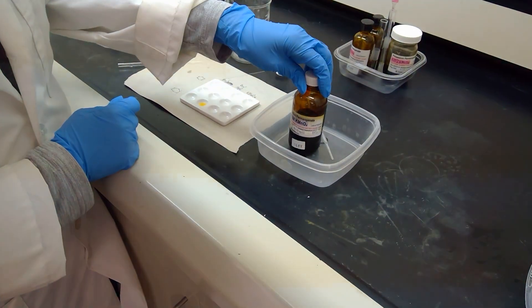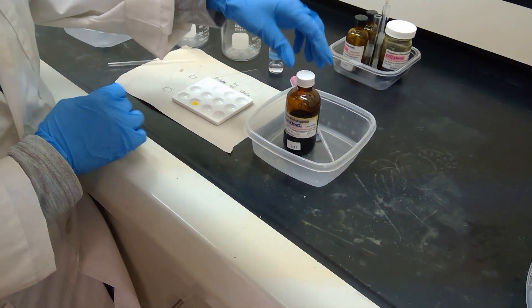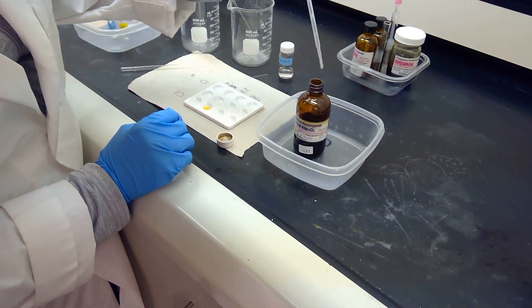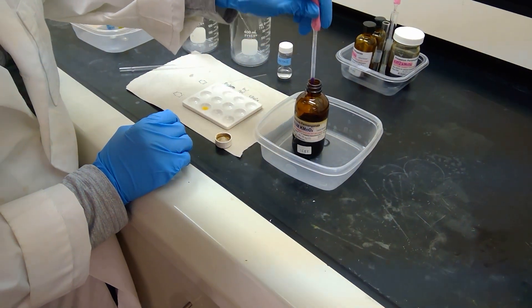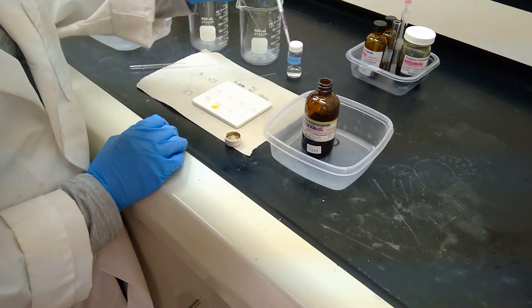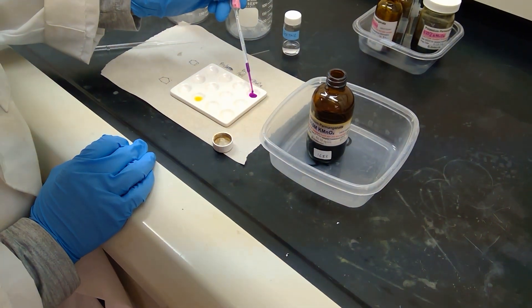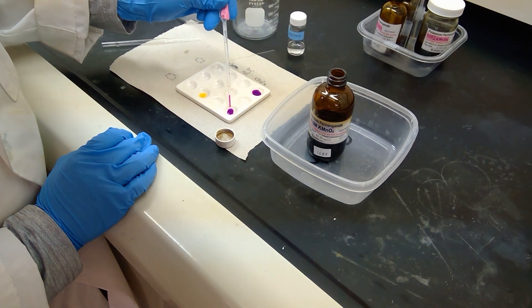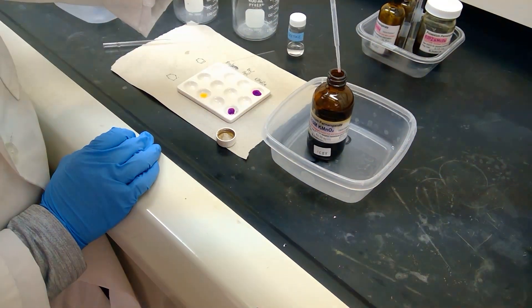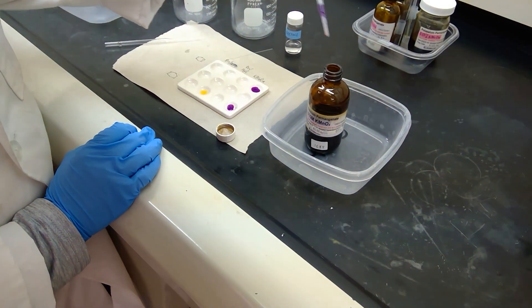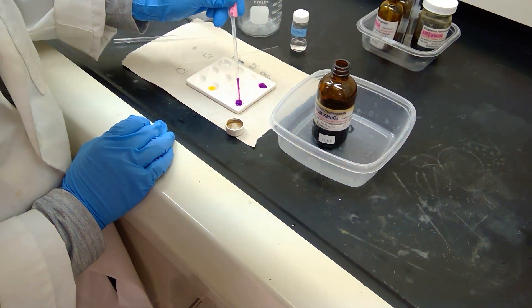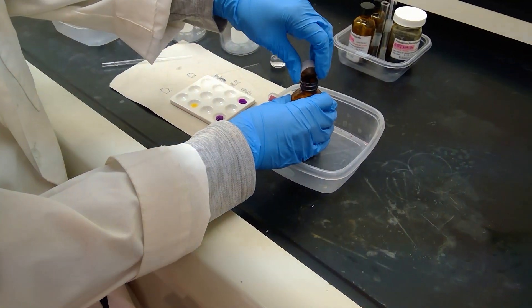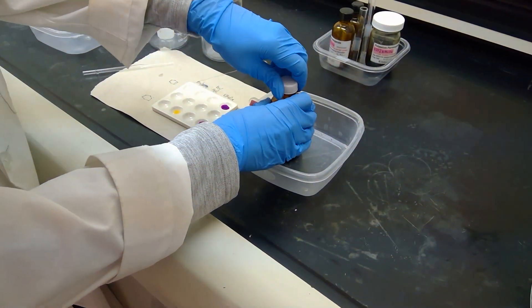For our next chemical test, we will be using some potassium permanganate. We're going to test both of the hydrocarbons from before. I'm going to take a couple of drops of potassium permanganate. Once I get it onto the spot plate, I want you to notice the color. We have a nice purple color going on. I have five drops of potassium permanganate into each of the wells.